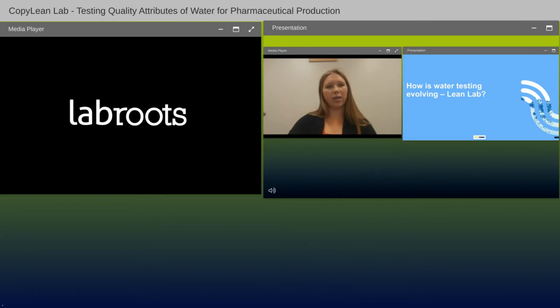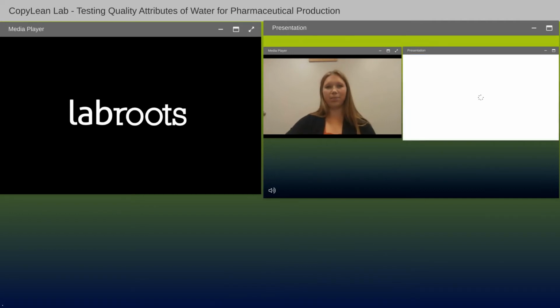Now that we understand traditional methods for quality attribute testing, let's transition to how quality attribute testing has evolved to incorporate these lean lab techniques. And again, we'll start with conductivity and TOC.